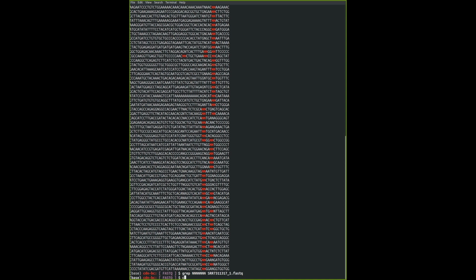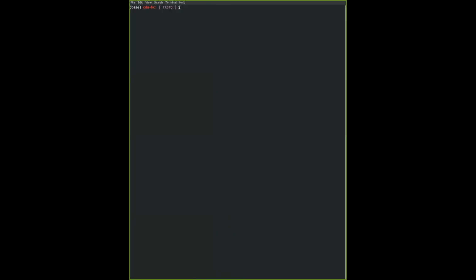To begin with, I'm going to clear the screen again. As you can see, there's quite a number of lines printed out, and if you just want to preview some of these lines, you can actually input a head. Those who have been with me in the R workshop have heard about pipe before. So pipe is, again, not an R standard function. It's common to almost all operating systems, all coding languages. So I'm going to type in pipe and show you. I know that some of you might have problems with pipe, and it looks like this. It's a vertical line.